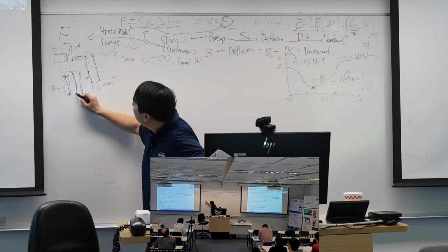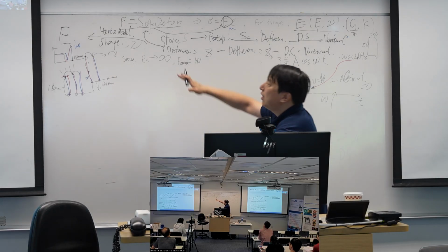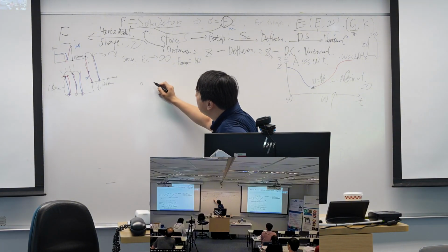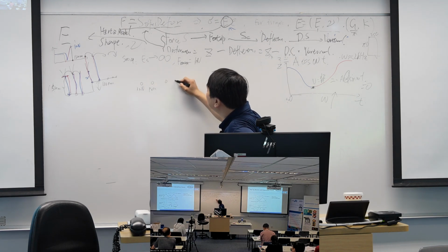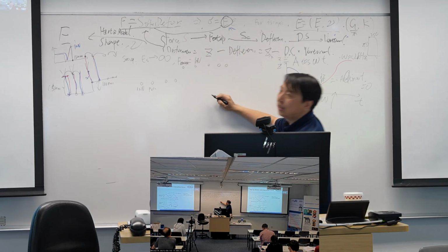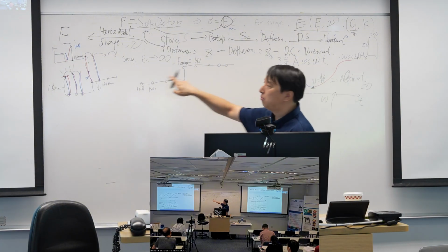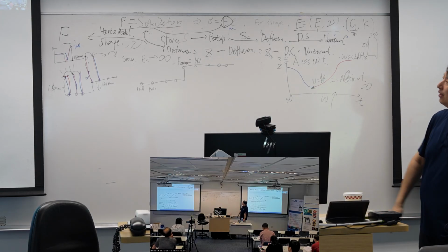I take a look at this point at maximum force. It looks like the probe just touched the surface at the force, as I said, 1 nanonewton. And then my idea is to capture all these 1 nanonewton points. I connect them one by one. This will be the morphology of the sample. Right? That's my idea.